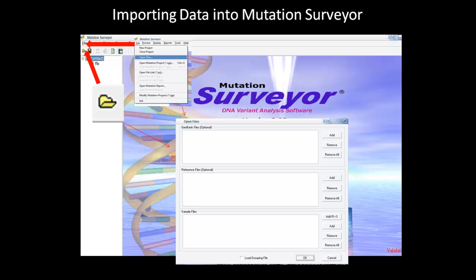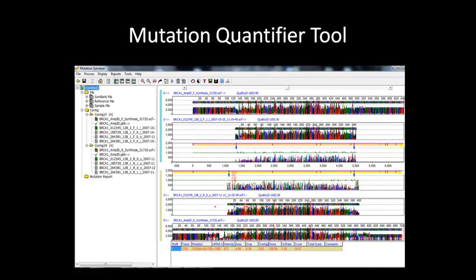If you load a GenBank file, the position reported for annotation will be relative to the GenBank file, and vice versa for the reference files. If both are loaded, the GenBank and SCQ files have priority over the reference files. The Mutation Quantifier tool can be accessed from the toolbar by clicking on the icon shown here. After clicking on this icon, a dialog box will appear with a couple options to choose from.